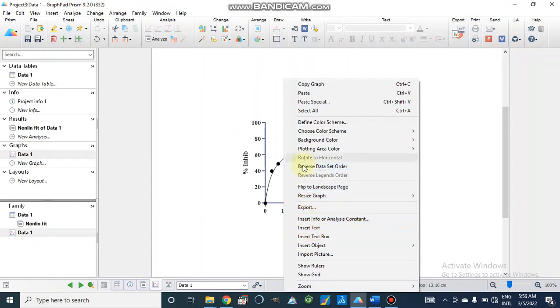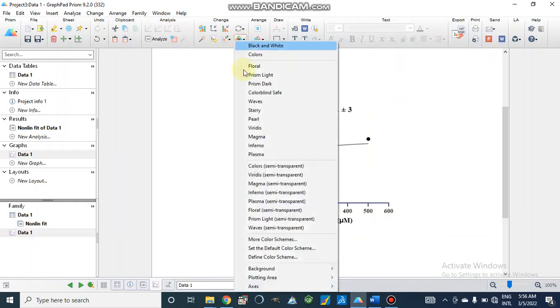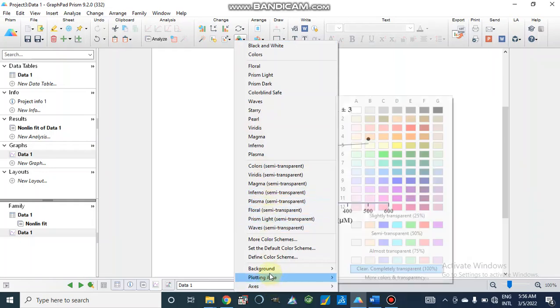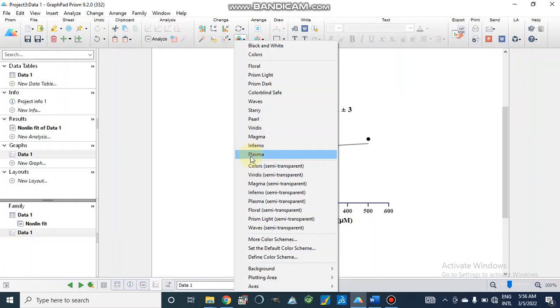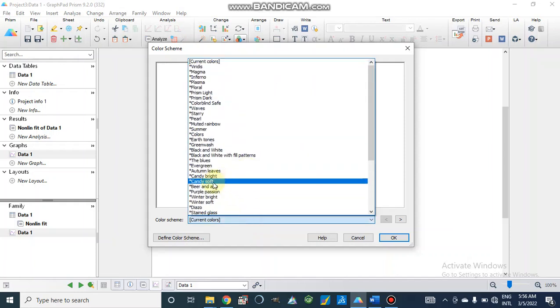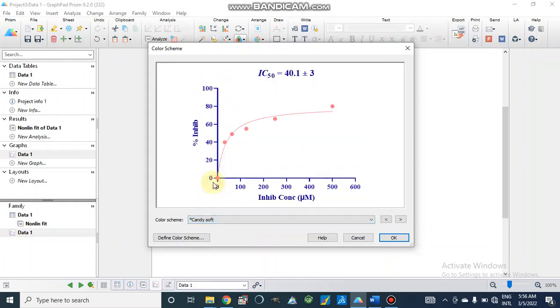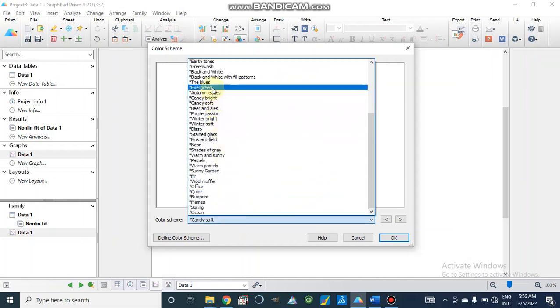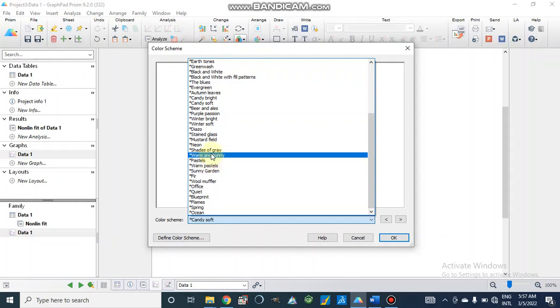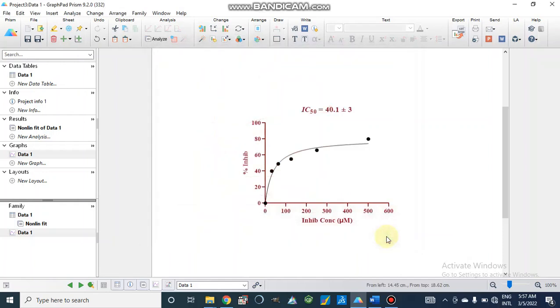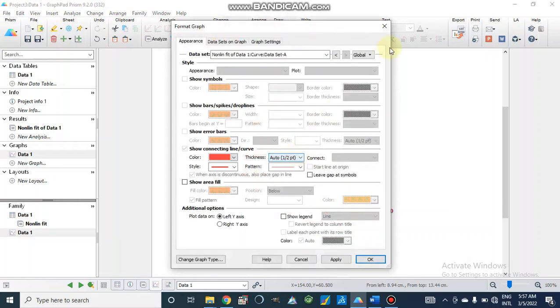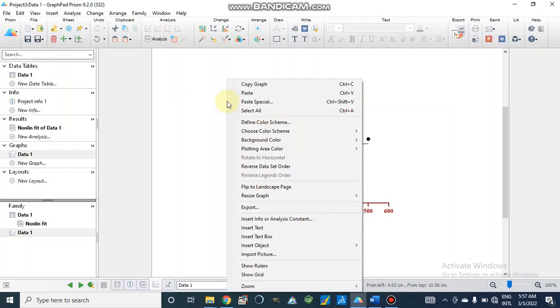It should be like this, Candy Bright, but it is not showing now. I don't know why it is not taking now, but we can choose different colors from here: Candy Soft, Candy Bright, green, black and white, or green measure.